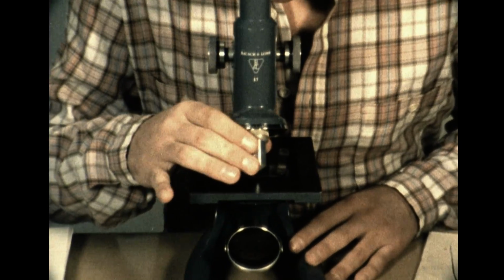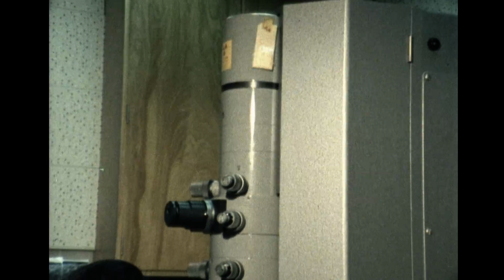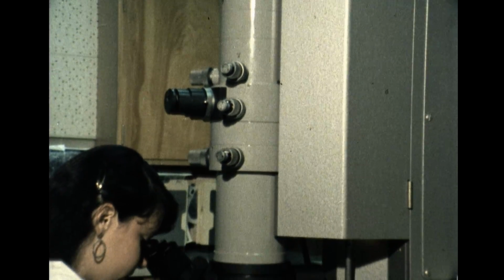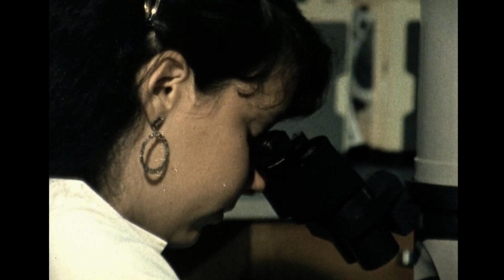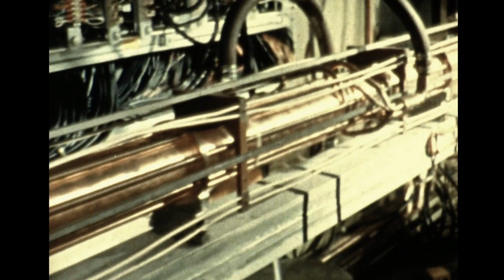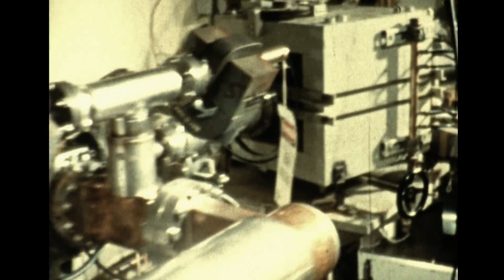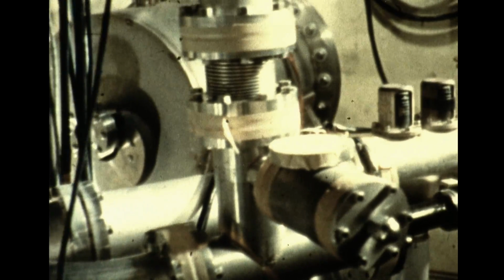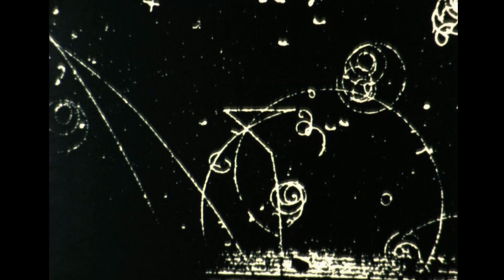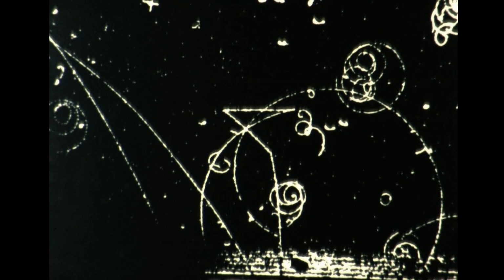The optical microscope can enlarge many hundreds of times. The electron microscope can magnify many thousand times by sending a stream of electrons through the sample. The atom smasher may be the ultimate microscope. It gives us information about the nucleus of an atom. So far, nobody has seen an atom, let alone its nucleus. But parts of the smashed atomic nucleus can leave traces, for example, on the emulsion of a photoplate, which can be identified by the atomic scientist.